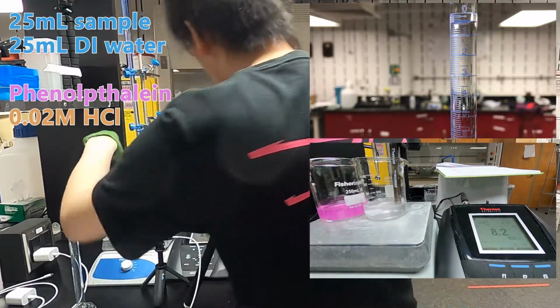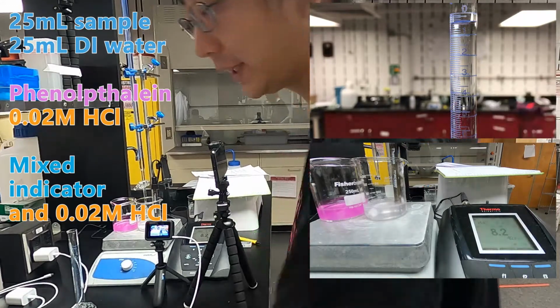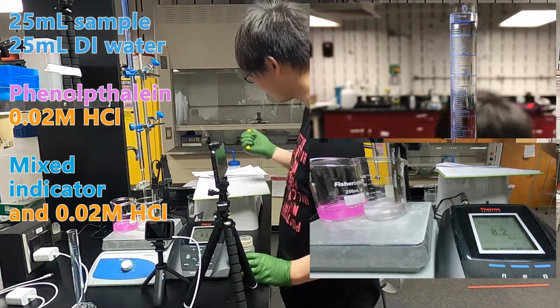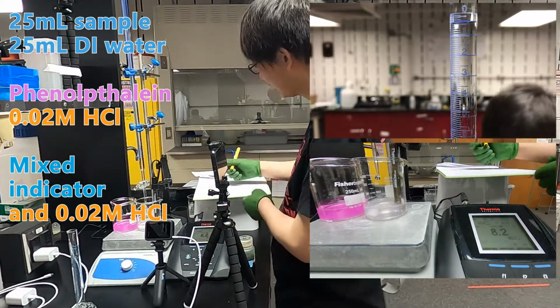When the color becomes completely transparent, then we add mixed indicator. And then we mark up this color change point, which is around 0.5.